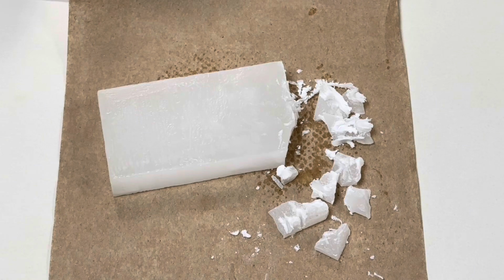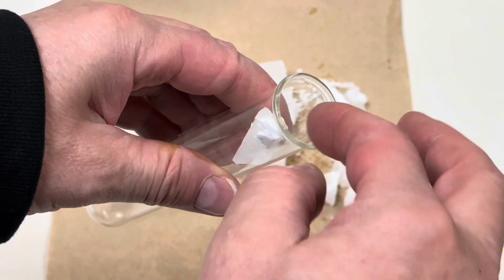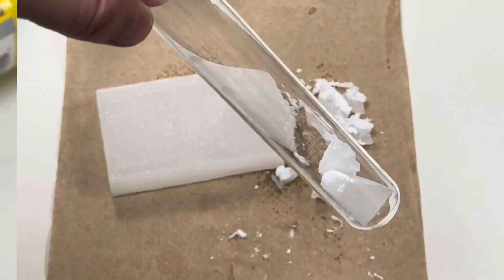Next, break off several pieces of wax that can fit down the neck of a second test tube. You're going to melt these pieces of wax into a liquid.